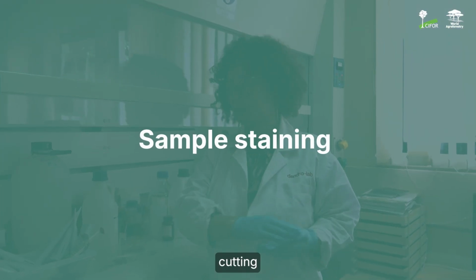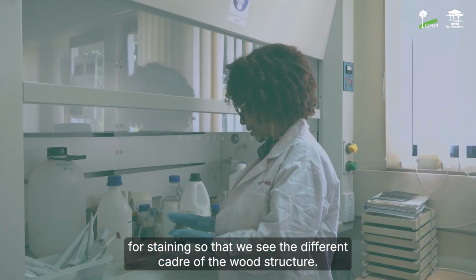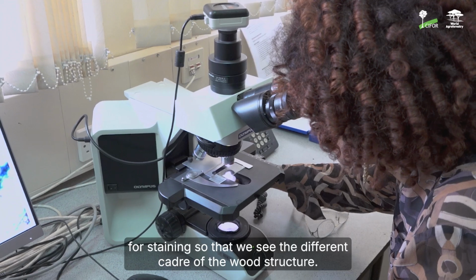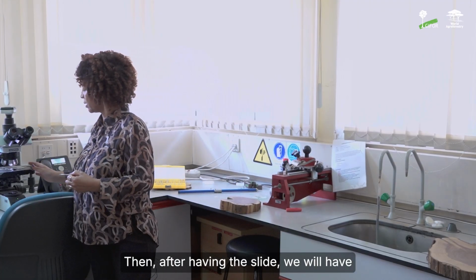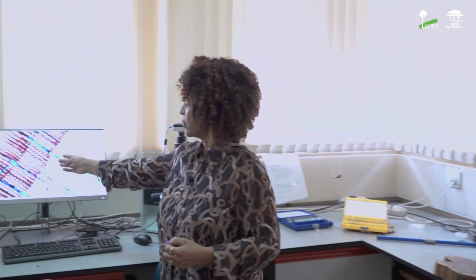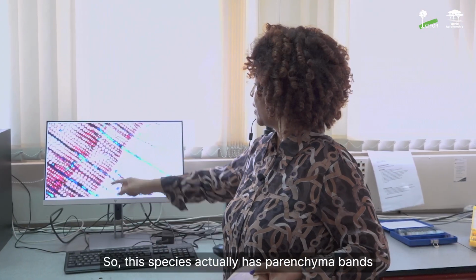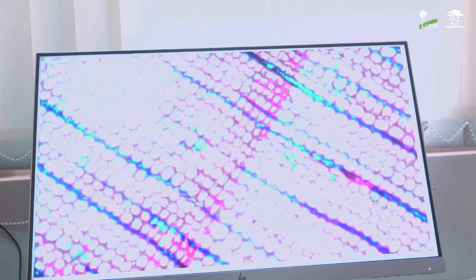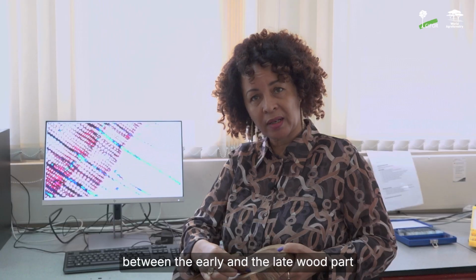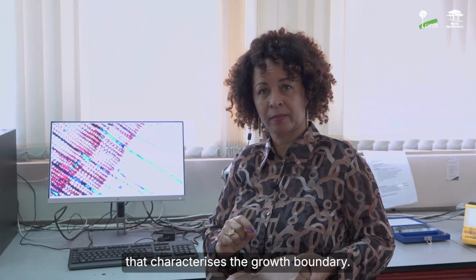After cutting the slides, we bring them here to stain them so that we see the different colors of the wood structure. Then after having the slide, we will have a picture like this. So this species actually has a parenchyma band, but also density variation between the early and the late wood part that characterizes the growth boundary.